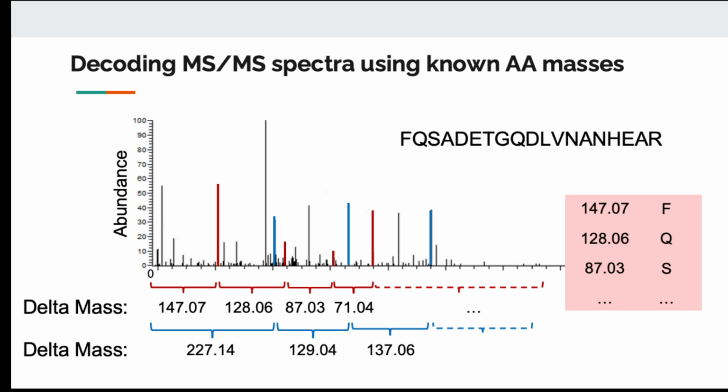And in theory, it looks like this. We have a spectrum, and we don't know the answer, which peptide it is. But we have to look at the mass-over-charge, and what we want to see are these gaps between two ions. If these two ions are adjacent fragments, the mass difference between them should correspond to the amino acid, as in the logic flow that we talked about earlier.